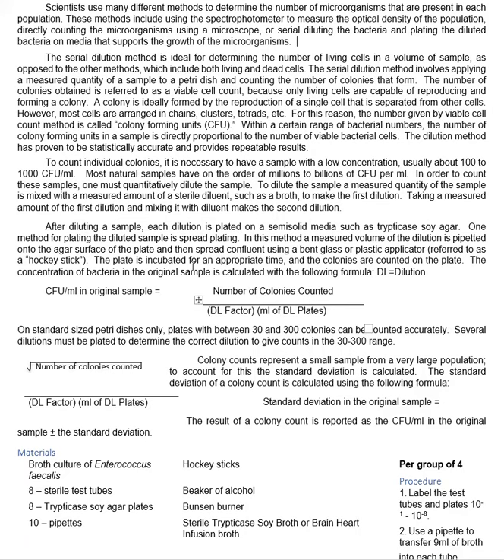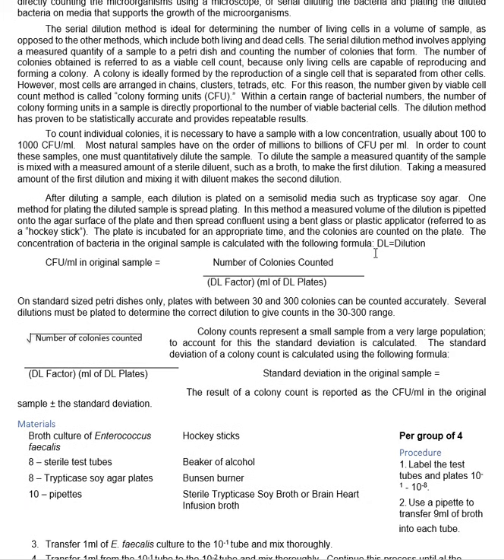We use that to spread out that 1/10 of a milliliter over the whole plate. And then we, of course, put them in the incubator upside down as always, and let them grow. And then when we get the growth, we can look and see what we have.